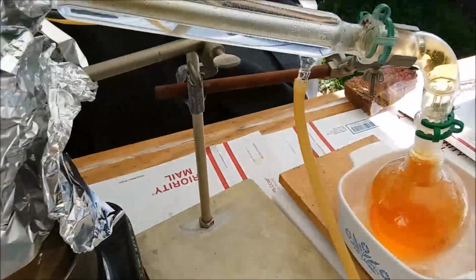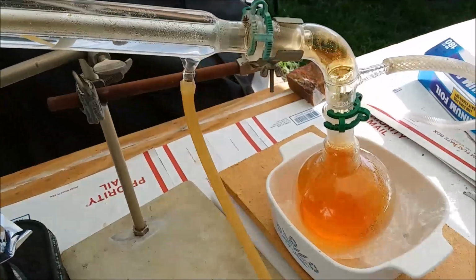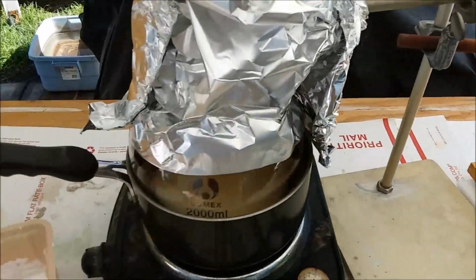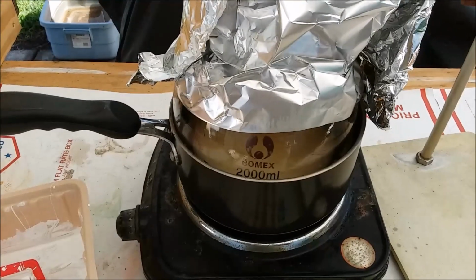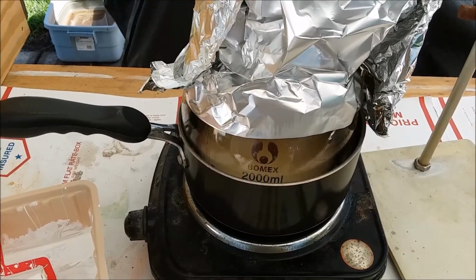Yeah, the rate at which the vapor's coming over has slowed down too now that the foaming has subsided. Very strange. But at least it's predictable, so I can deal with it.